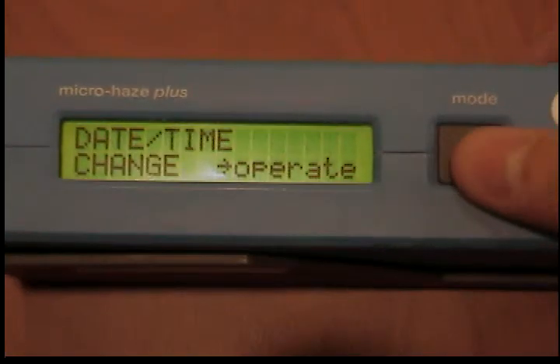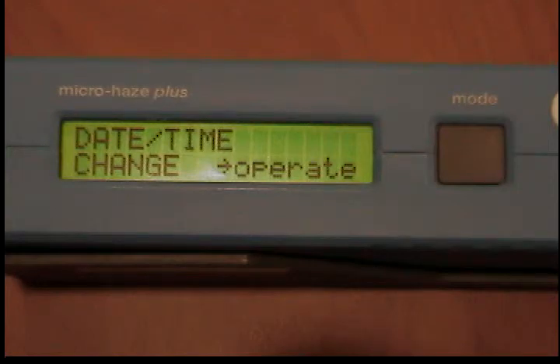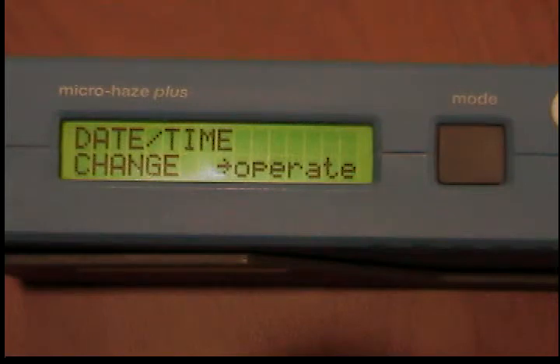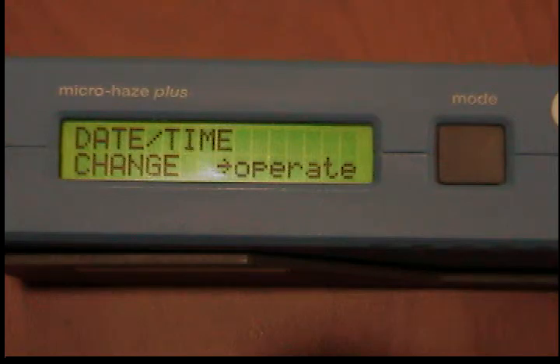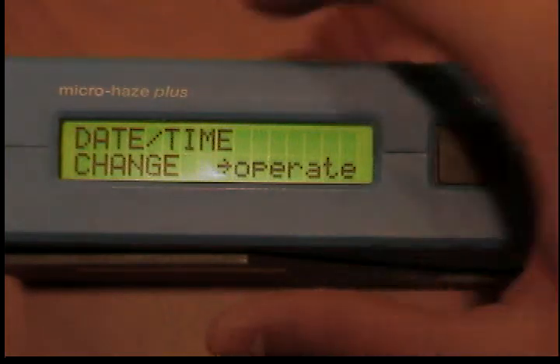Change date and time. The instrument contains an integrated clock so that the date and time of the measurement are available in addition to the measured value. This may be useful for printing purposes, for example. In statistic mode, the time and date are also stored in memory. To set the internal clock, insert the instrument into the protective holder and switch it on with the mode button. Press the mode button repeatedly to skip over the calibration until the display change date and time appears. Press the operate button to display the date.